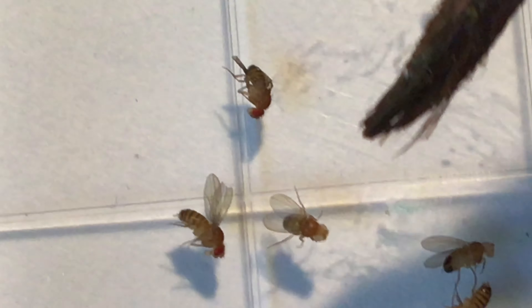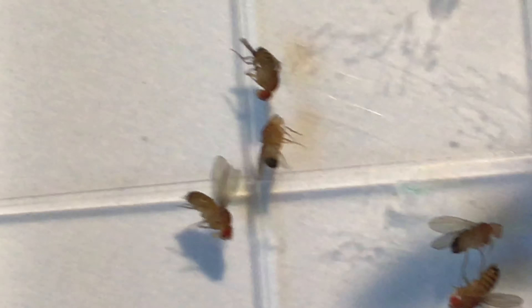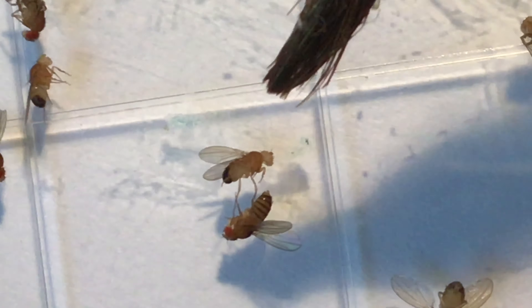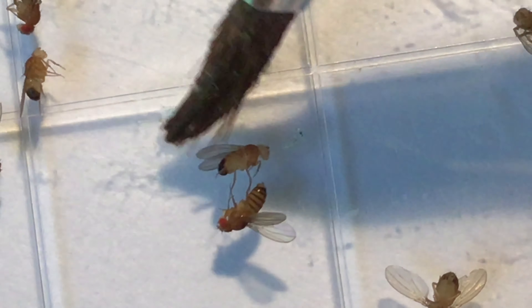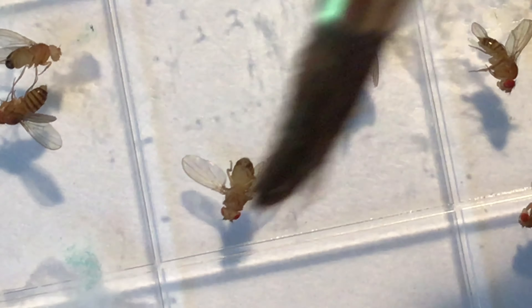This fly here is also a female — note the banding pattern on her abdomen — and both female flies have red eyes. This is a male fly: look at the darker, thick black band on the abdomen. This fly here is also a male, starting to wake up from his nap. And here is a nice example of a male with white eyes, while this female has red eyes.